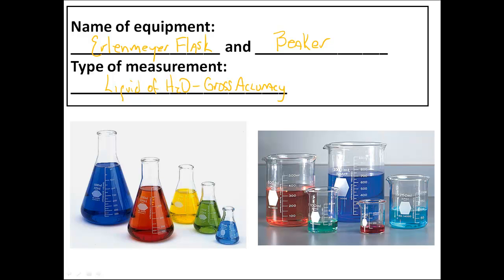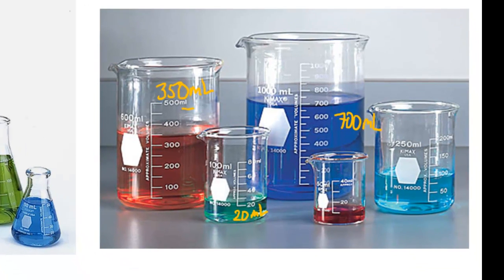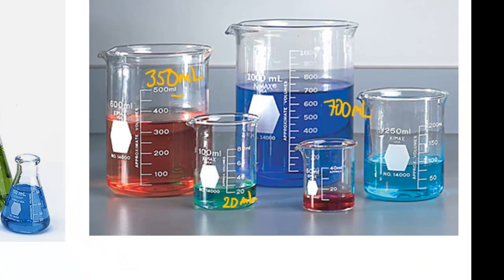If you take a look at there, that looks like that's just about 350 milliliters, which it says right there. This is going to be plus or minus probably 10. That one looks like it's 700. Again, plus or minus a few. This one down here looks like it's about 20, plus or minus a few. This one you'd have a tough time finding 323. You couldn't do it. You could find 300 plus.